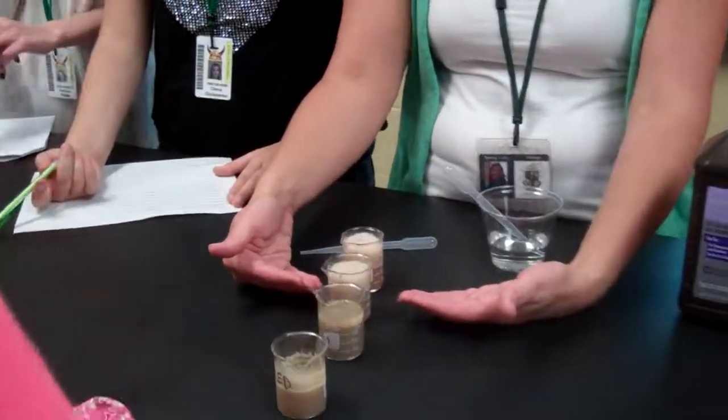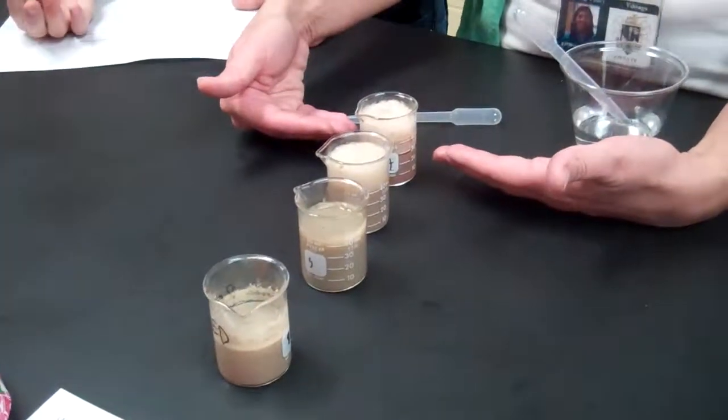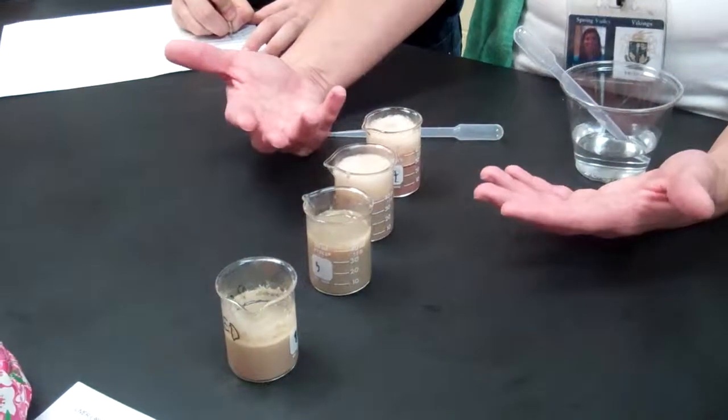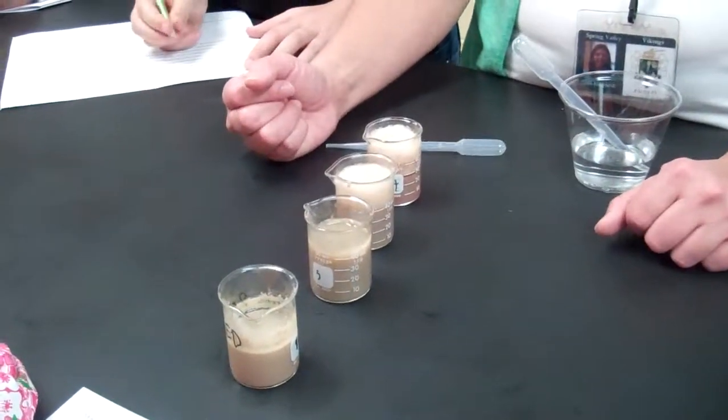Buffers. Very good, Kari. So this liver enzyme, when I added the base to it, was a weak one. The liver had the buffers to resist the change in pH. So, are there still enzymes here? Yes. Are there as many enzymes as there was in the raw? No. So the reaction was not as great, but you still saw some because the buffers resisted that pH. Cool?